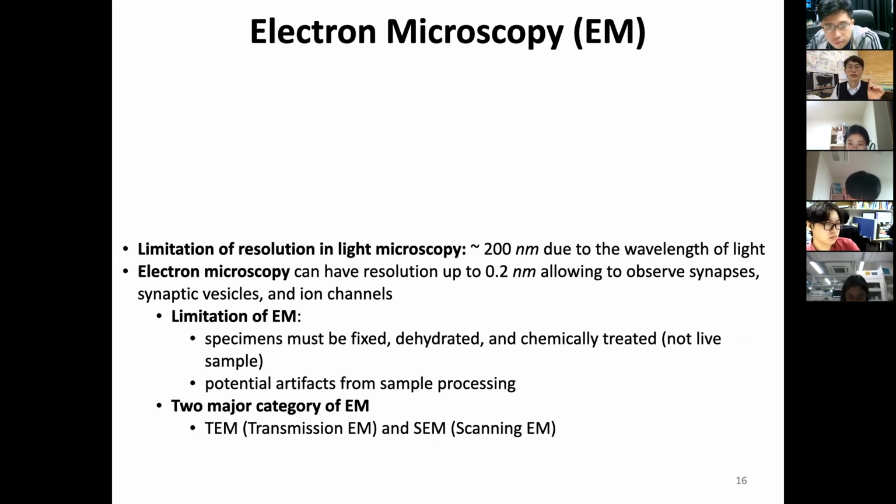So the energy of the emitted photon is in its color. So if the energy is actually lower, then it has a longer wavelength, we can see deeper. So the depth of imaging depends on the color. And the limitation, why we cannot see below 1 millimeter.